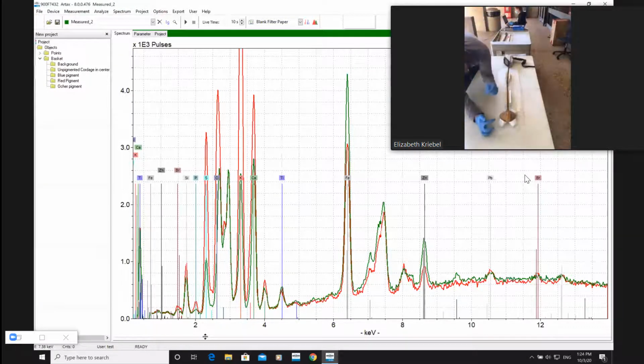So I can tell you this has been used, because look how smooth the quartz is here, and look how rugose it is right there. You see all the pecks. It's like a hammerstone, you know, when it's got the little pecks on the edge. You've got pecks on this guy here too. So it absolutely is used. Maybe not a lot, but you see rugosity on this tip right here in particular. That's not present on the smooth surface.